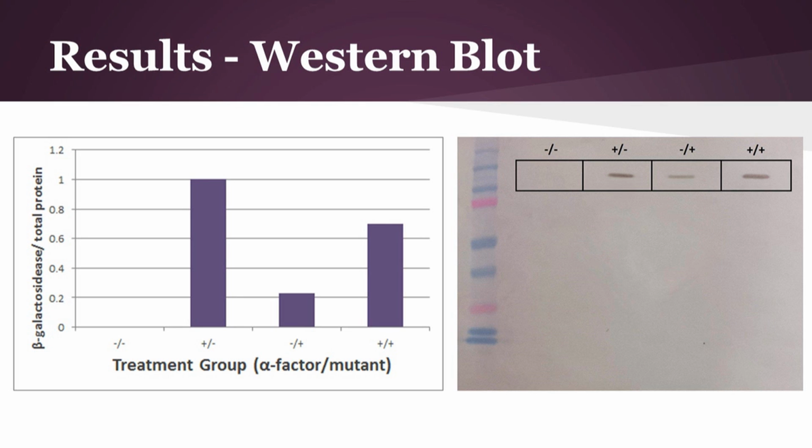As there was only one replicate for each condition, we did not run statistical analyses on this data. However, trends seen in the Western blot data are very apparent and support the results from the previous two assays. Now Tori is going to continue on with our discussion.